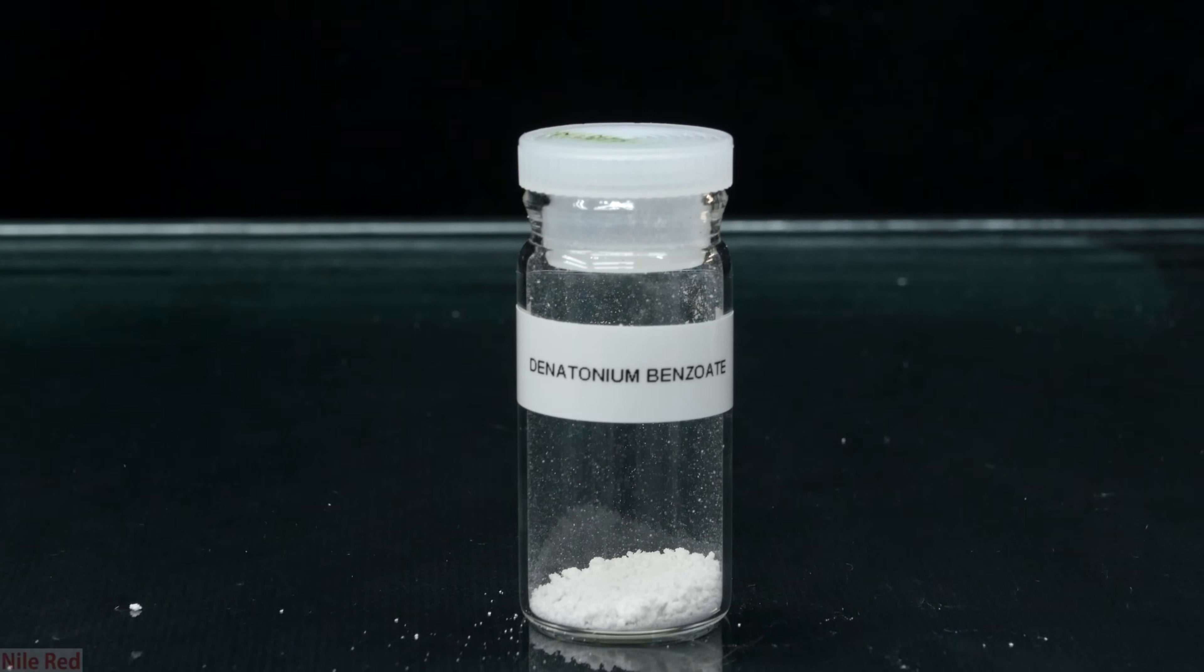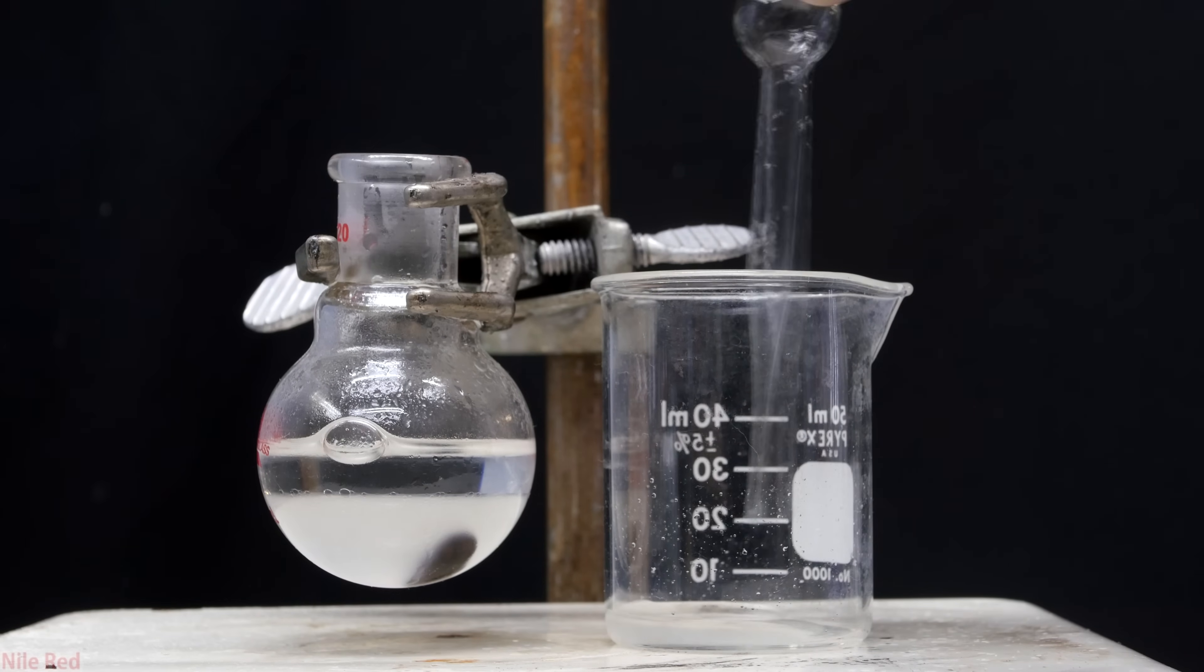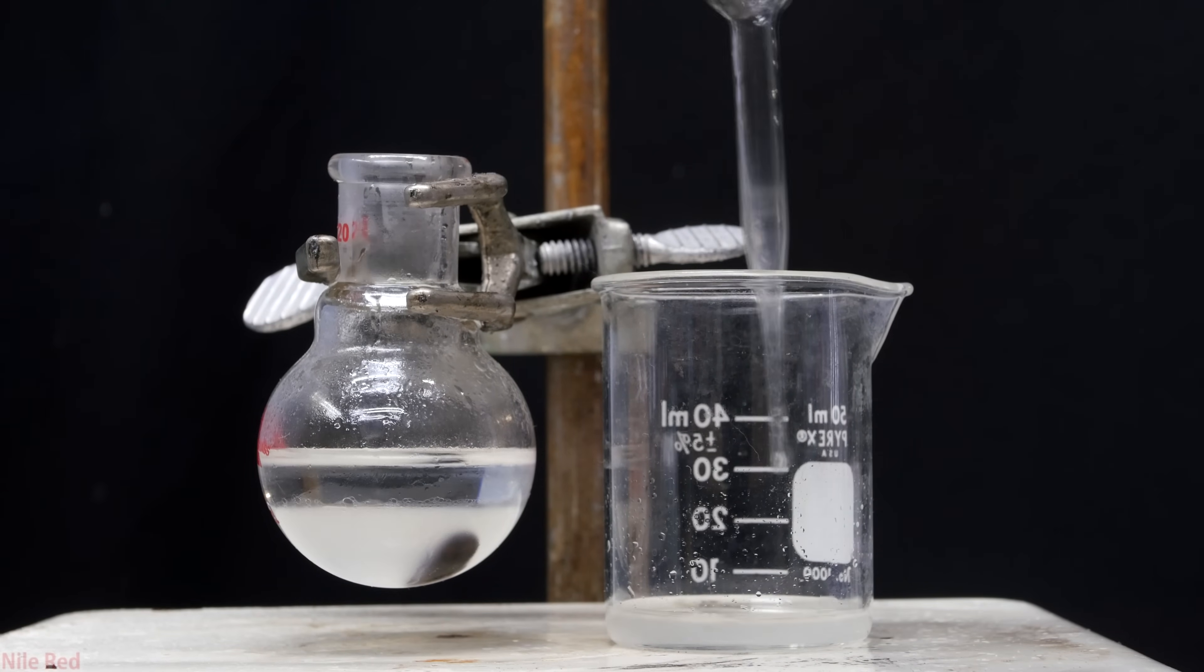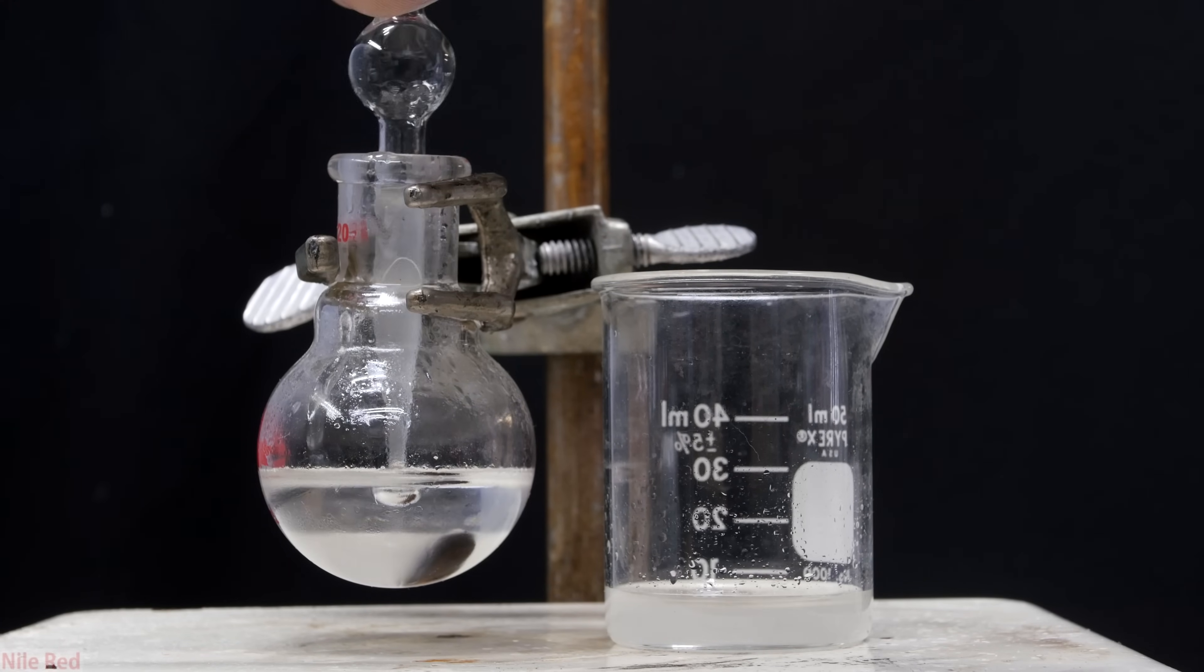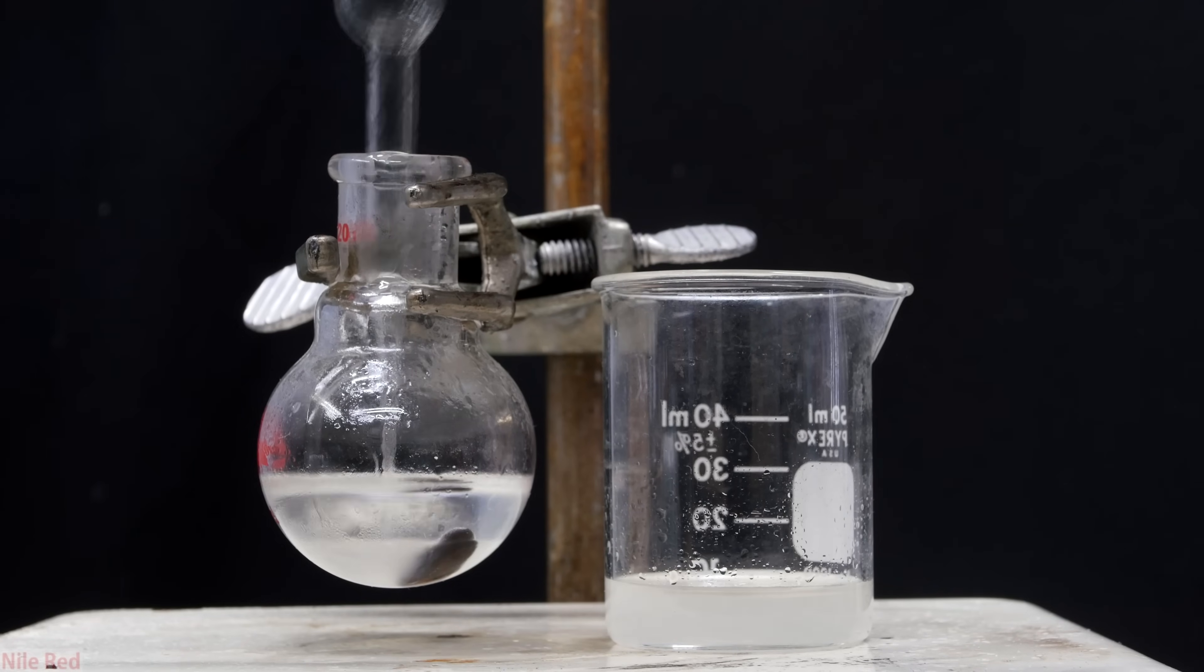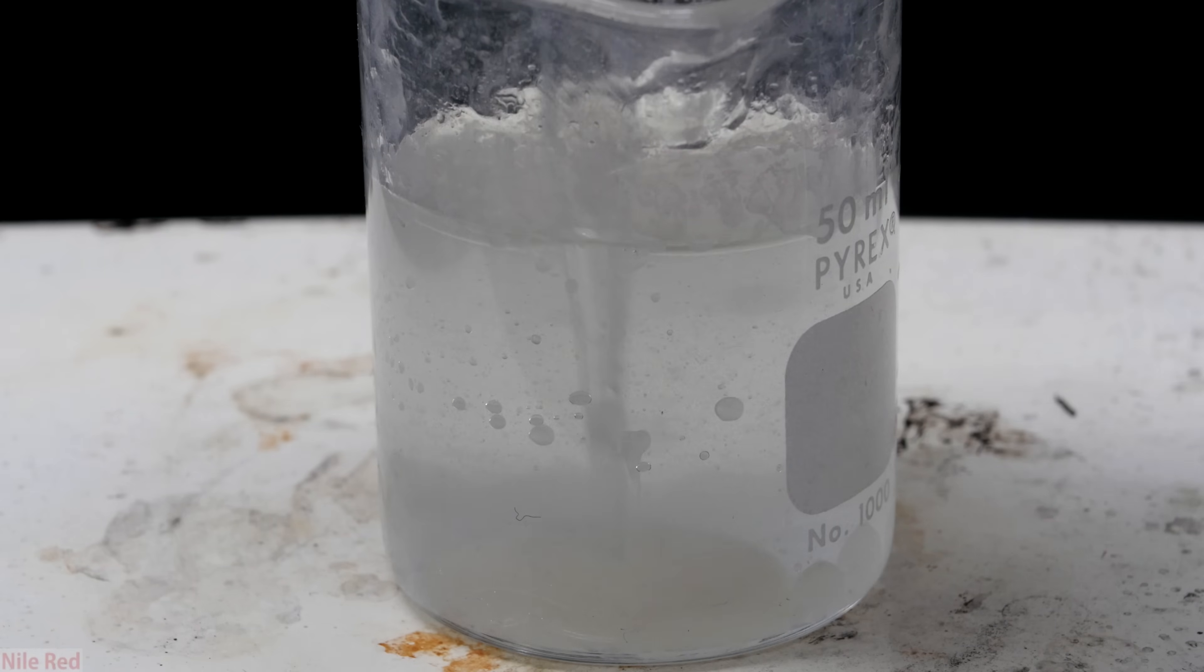Today we're going to be making a little bit of denatonium benzoate, which is a super bitter compound. One of the common brand names is Bittrex, and it's basically just used to make things bitter. It's commonly included in various chemicals and alcohols that you really shouldn't be drinking, like methanol or paint thinner. It also has some niche uses like in special nail polish to prevent nail biting.